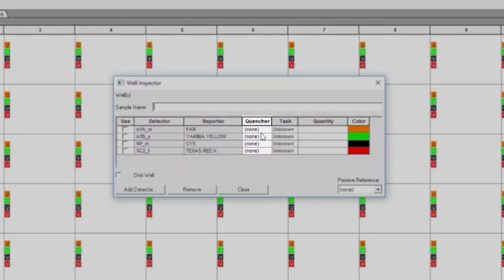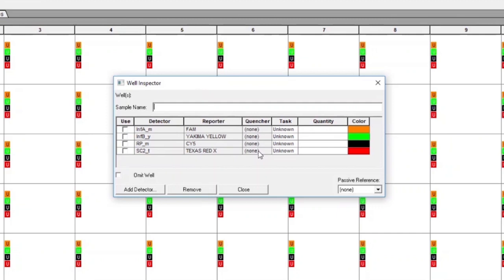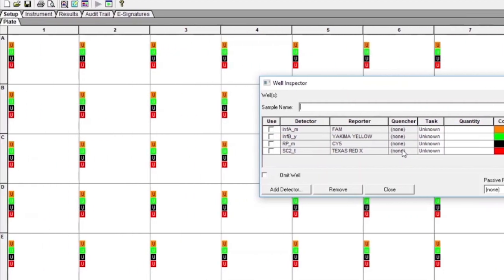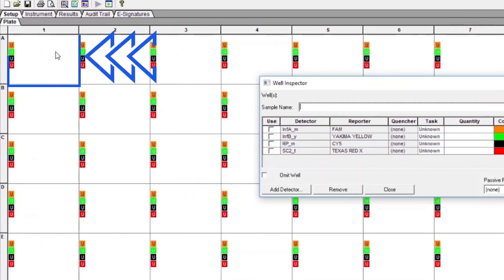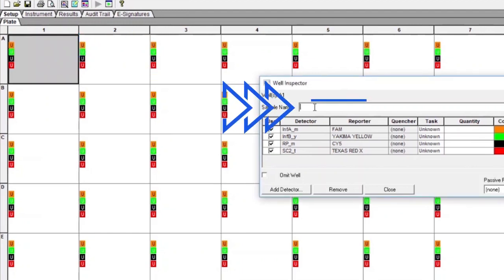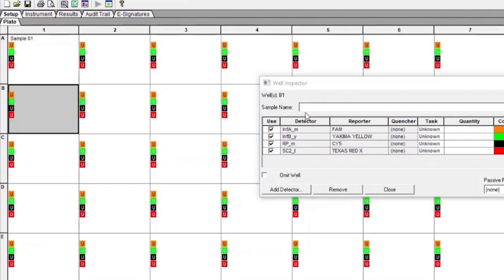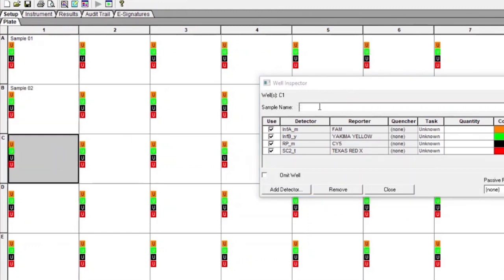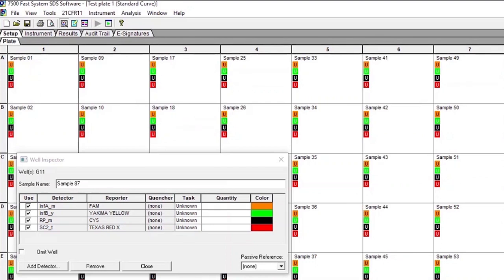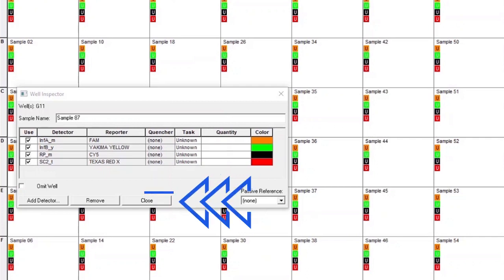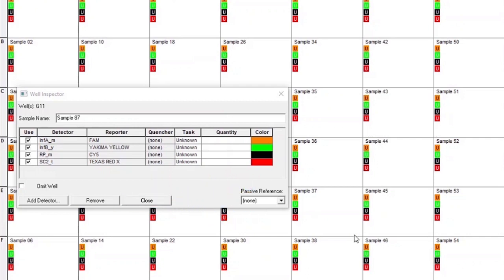To label wells with sample or control IDs, highlight each well, and in the Well Inspector screen, add an appropriate sample ID or control ID into the sample name box. Repeat this step for each well until all sample identifiers and control identifiers are added to the plate setup. Once all specimen and control identifiers are added, click the Close button on the Well Inspector window to return to the Plate Setup tab.